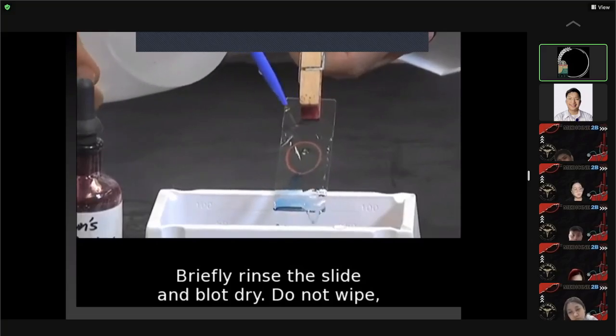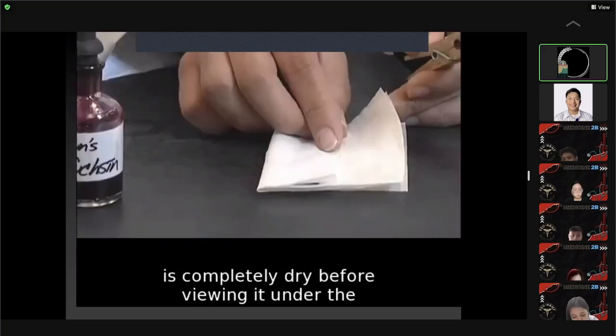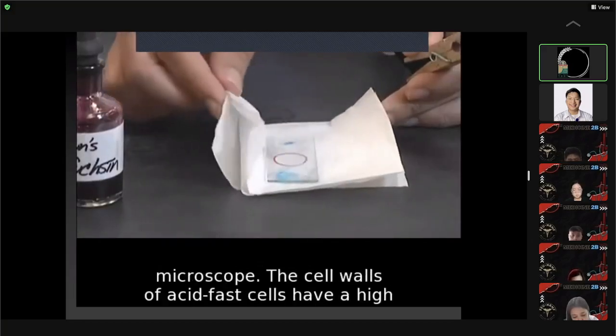Do not wipe, just gently blot the slide. Make sure that the slide is completely dry before viewing it under the microscope.